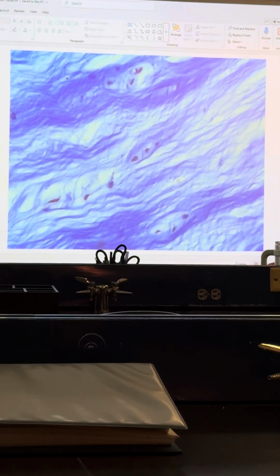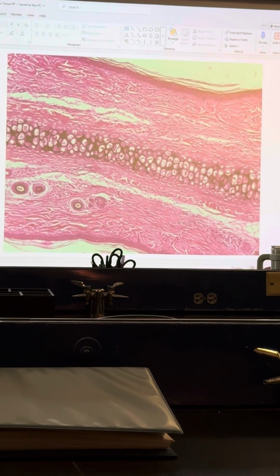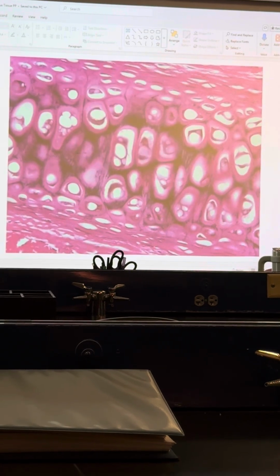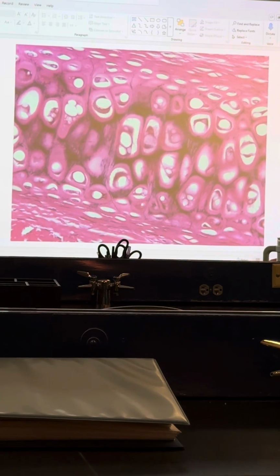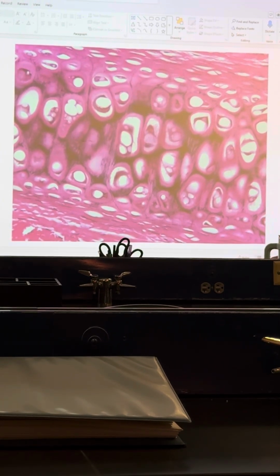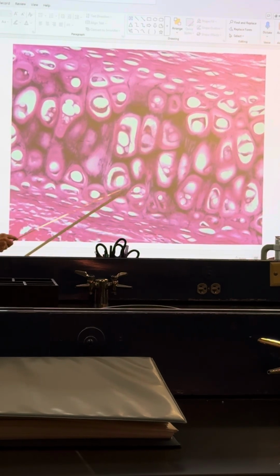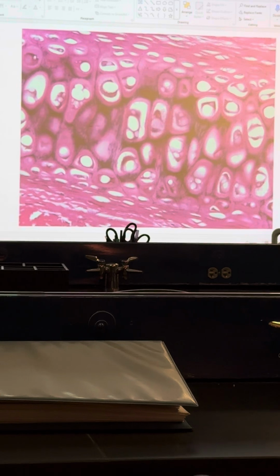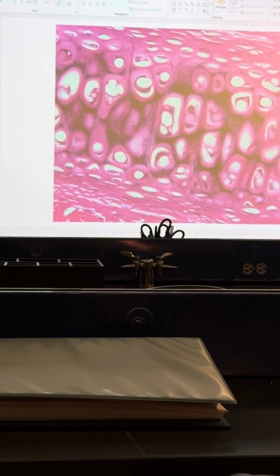Okay, let's go to this one. Looking in the middle there, down the middle strip. What is this one? I heard cartilage. Hyaline cartilage. You see all these black fibers though. What does that indicate? What kind of cartilage is it? It's gonna be elastic cartilage. Yeah, elastic cartilage. Remember the outside of your ear there? The external ear is elastic cartilage.